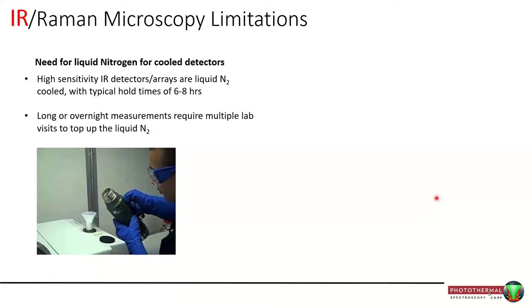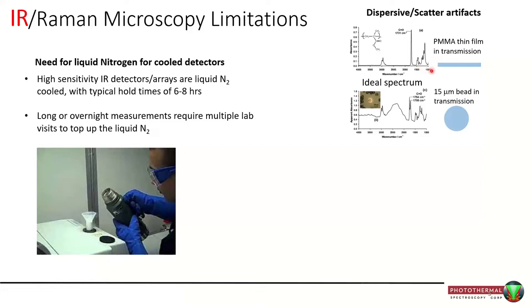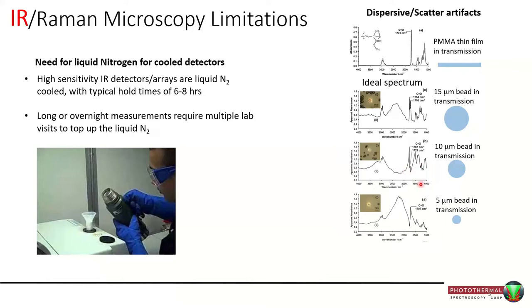These systems nearly always require liquid nitrogen cooling, which is a hassle. But what I consider underappreciated issues with traditional FTIR and QCL microscopes are dispersive and scatter artifacts. Imagine a PMMA thin film measured in transmission — you get a lovely spectrum with a flat baseline and symmetric peaks. But take the exact same material as a 15 micron bead and measure it in transmission, and the spectrum looks very different: baseline offsets, weird baselines, shifted and split peaks. Change the shape while keeping the material the same and the spectrum looks different yet again. It really shows how spectra can be very dependent on particle shape, size, and surface roughness in addition to any chemical differences.